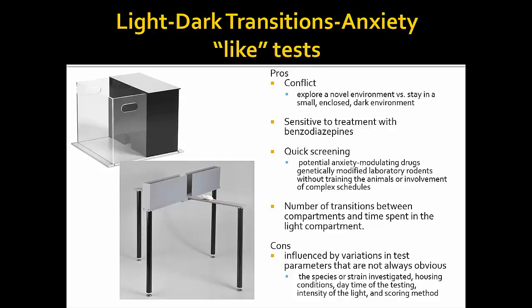And this is good because you can do a quick screening of your test drug if you think, well, is this going to have an anti-anxiety-like effect on the animal? Or, say you have an animal going through drug withdrawal, and you'll know an animal going through drug withdrawal will not explore their area or anything. So you're going to give them a therapeutic agent. Does it block that part of the withdrawal?